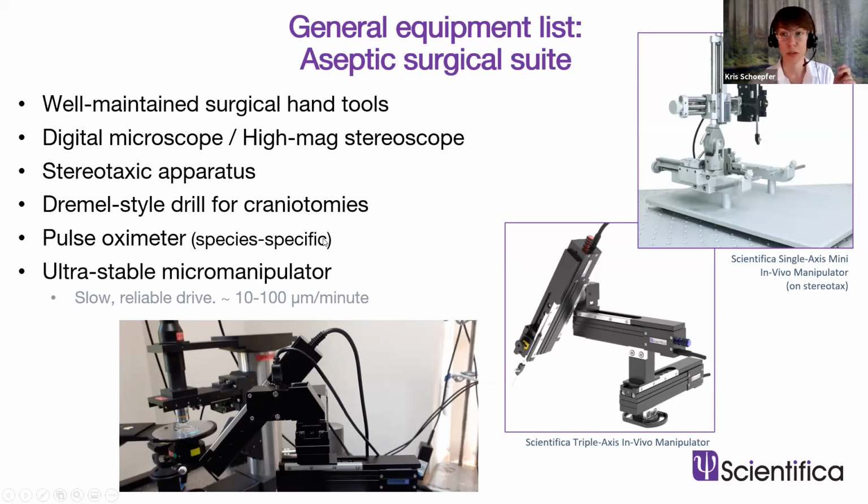It's a little tricky to do by hand and keep it consistent in movement, so we highly recommend a motorized manipulator for this part.